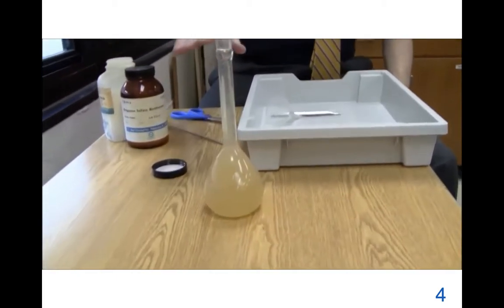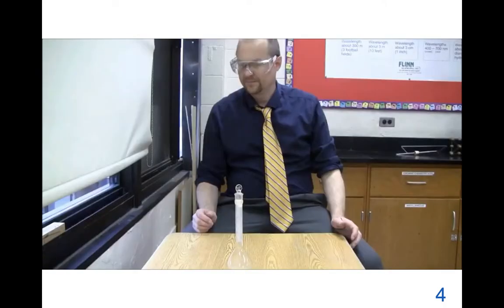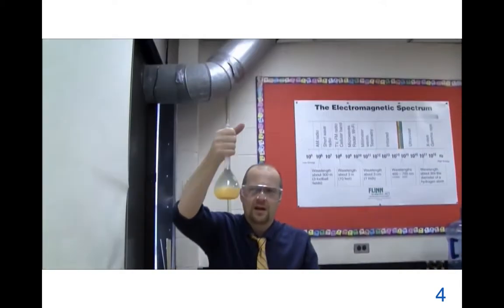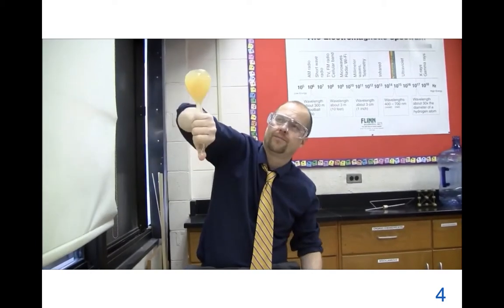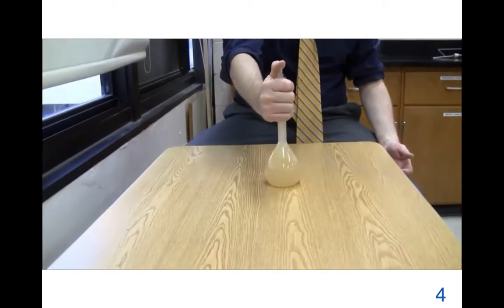Set it down, and you've got to let the precipitate settle out about halfway. And once the flocculant or the precipitate has settled out about halfway, shake it up again. And then wait again for the flocculant to settle about halfway.